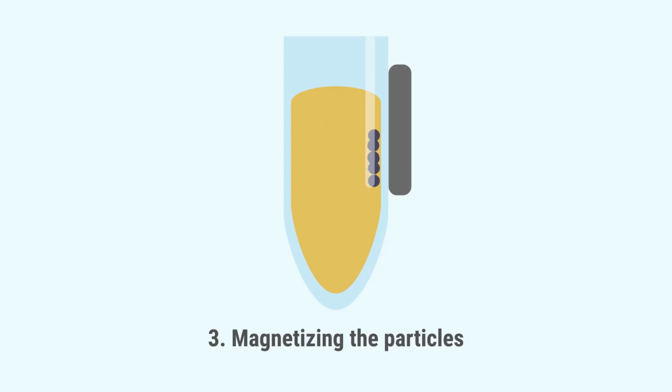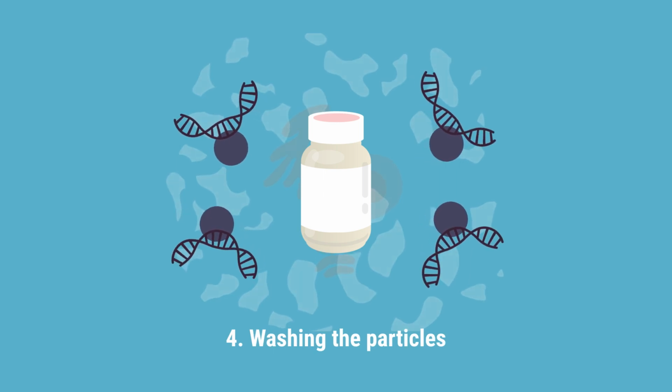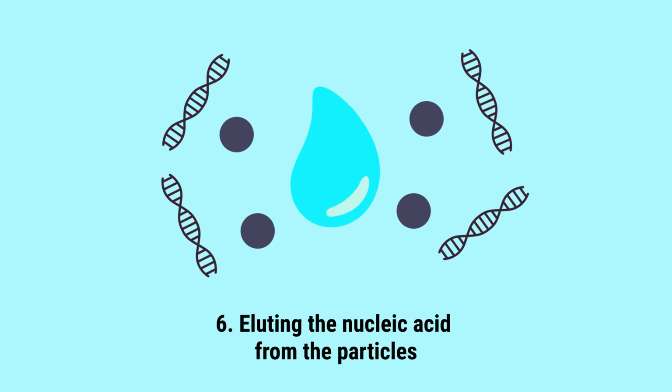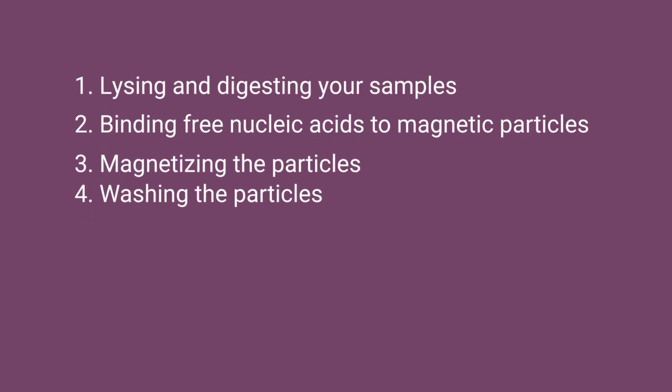3. Magnetizing the particles. 4. Washing the particles. 5. Drying the particles. 6. Eluting the isolated and purified nucleic acid from the particles. There are many variables to optimize in these 6 steps.